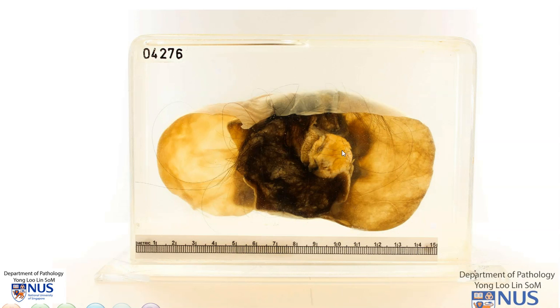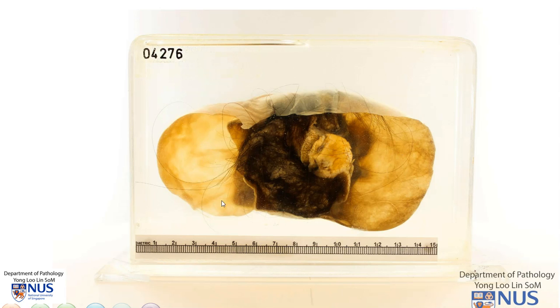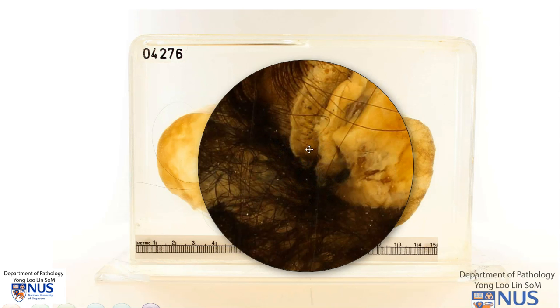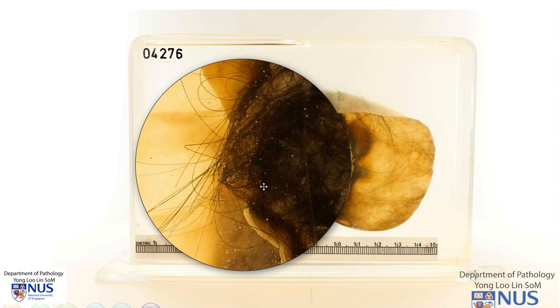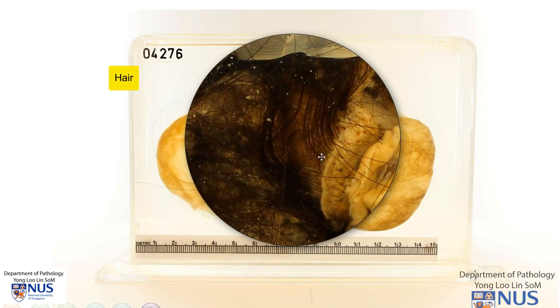Now looking at the cut surface, we can see that there are several compartments or locules to this cystically enlarged ovary, and so we can call this a multilocular cystic ovary. Some of the locules appear to be empty, but in this central one we can actually see that there are some hairs arising from the wall of this locule or from the lining.